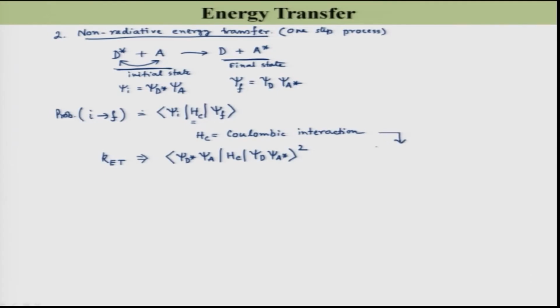So, the interaction energy between two dipoles. Here I said that one is μ_D, another is μ_A, one for the donor, another for the acceptor, right.